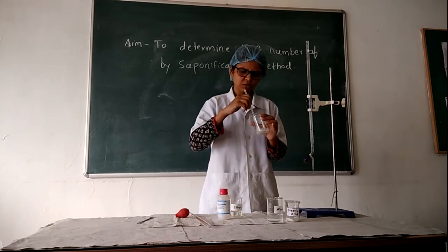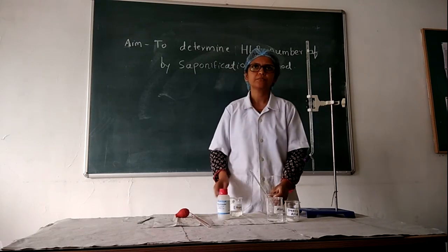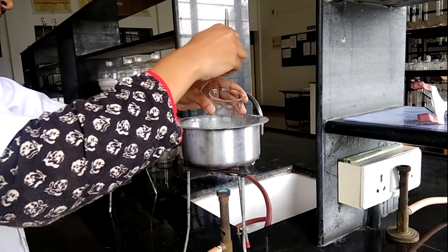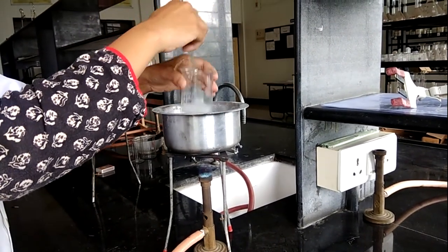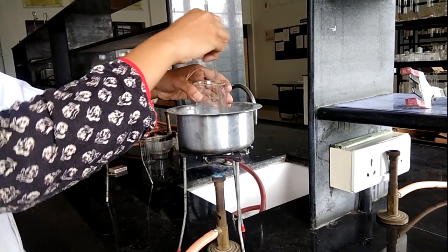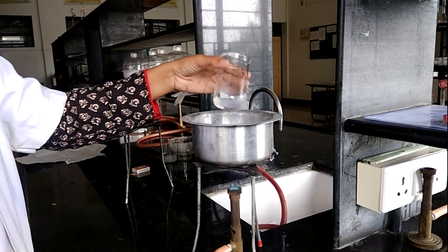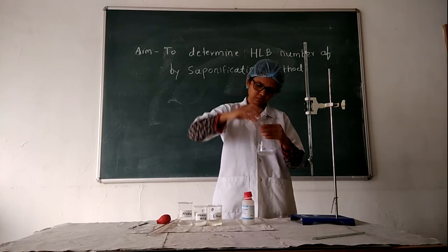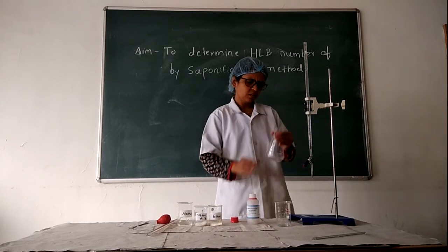We need to heat this solution so that the stearic acid will solubilize. Heat it in a water bath until it is solubilized. During heating, take care because we are heating alcohol and ether — hold the flask properly. Now the stearic acid is solubilized in this ether and alcohol mixture. We will now transfer it into the conical flask, add phenolphthalein indicator, and titrate it against 0.1 normal NaOH.